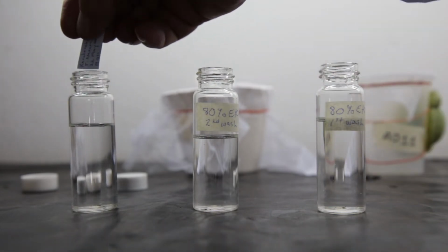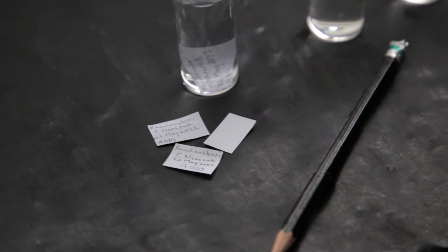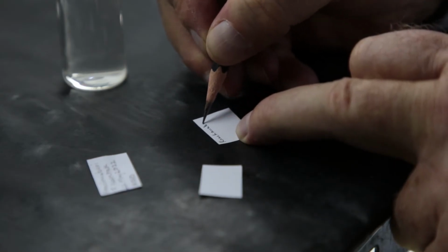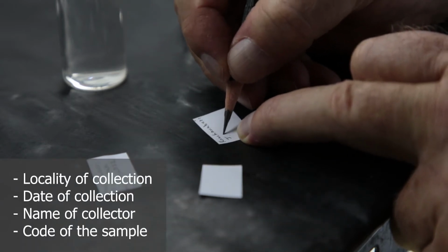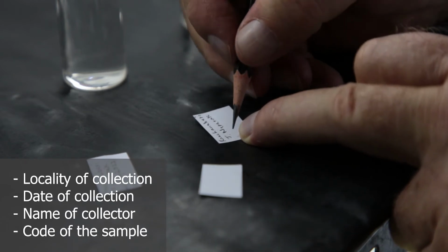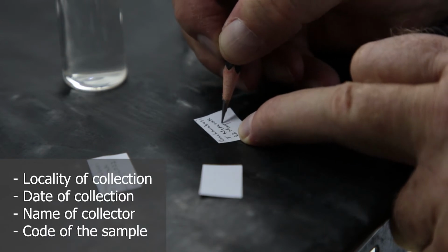Now insert a label with a code and collection data on a small paper label inside the ethanol, using a pencil for writing or India ink which does not dissipate in the ethanol. The data label should ideally have the locality of collection, date of collection, name of collector, and the code of the sample which links it to the data spreadsheet.